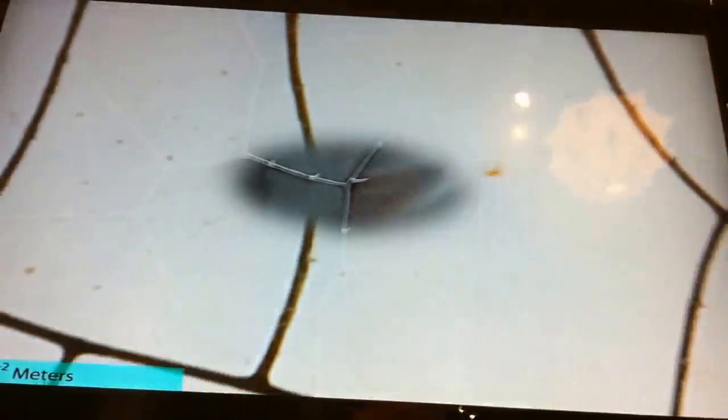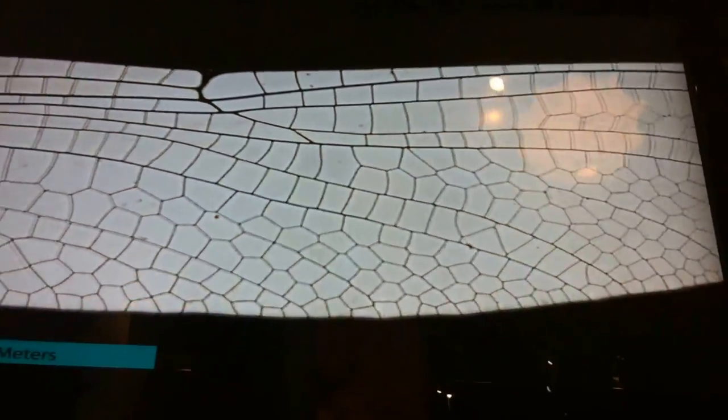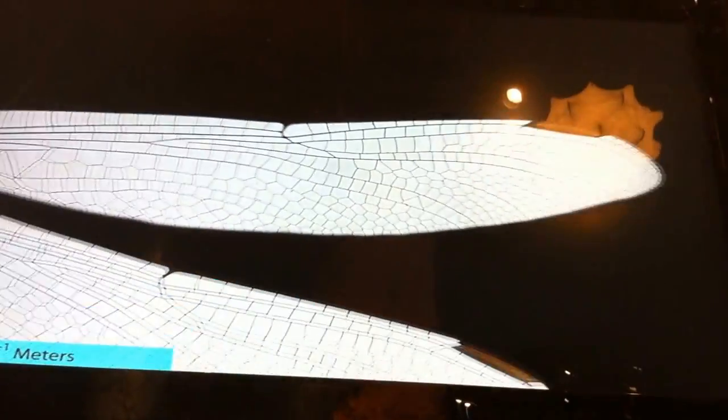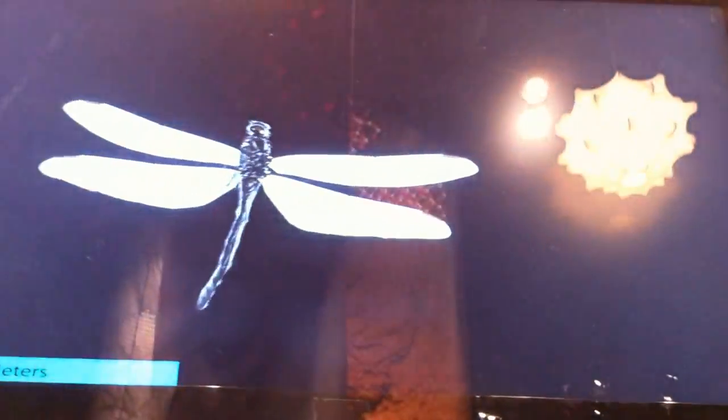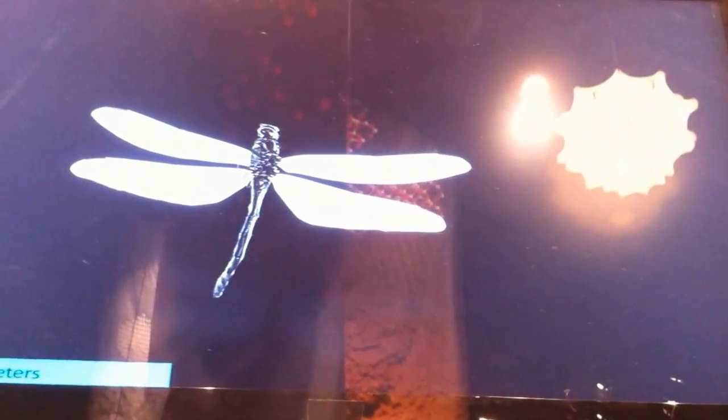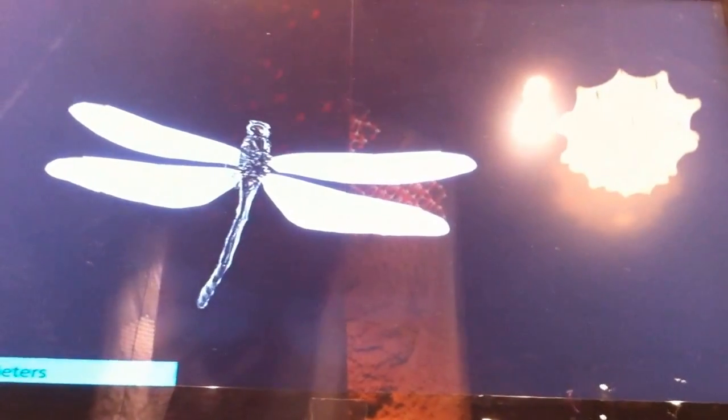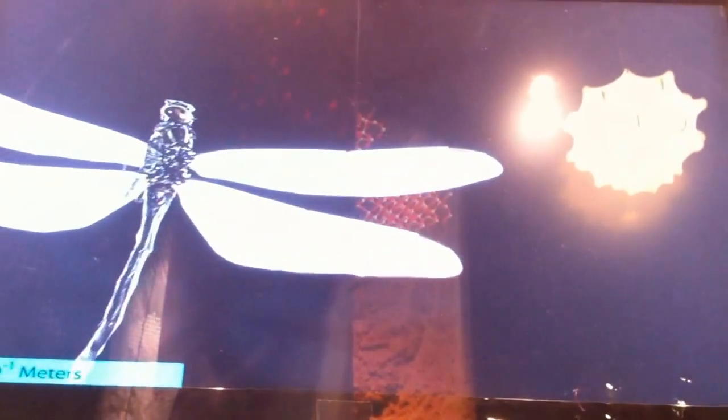Oh, what's that? I don't know. What could it be? Here we go. Let's watch that going the other way.